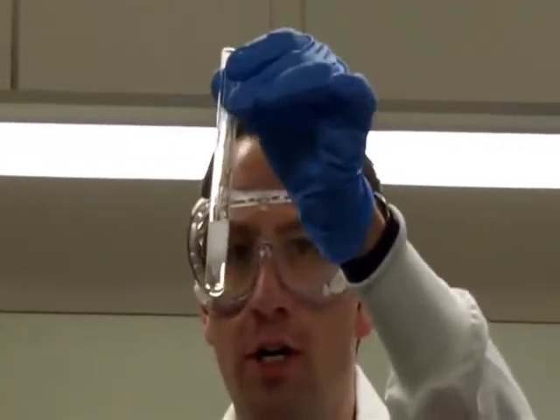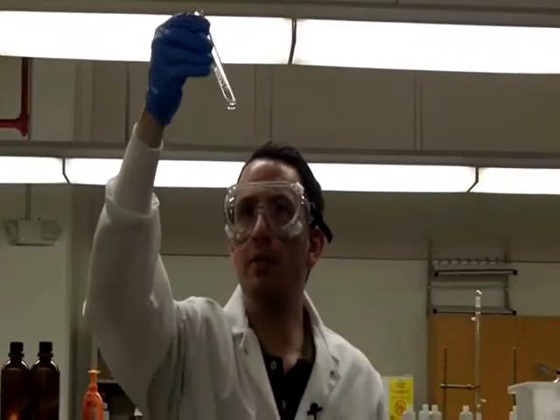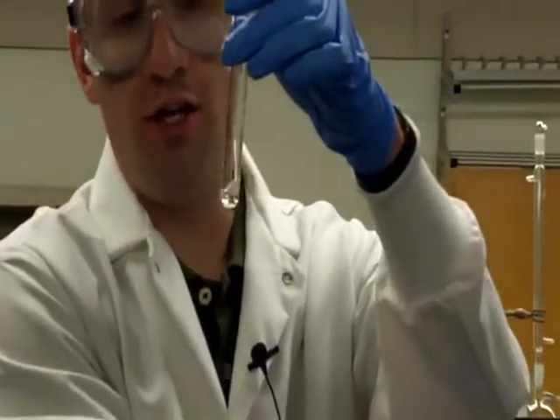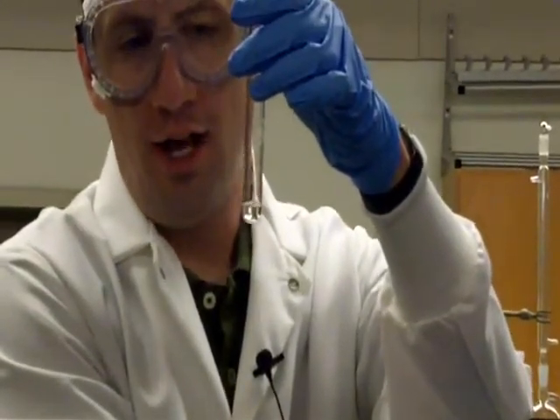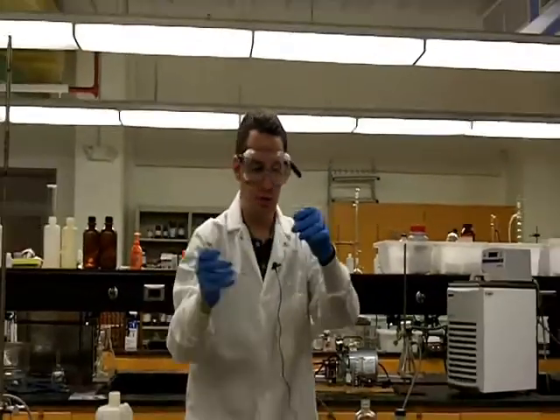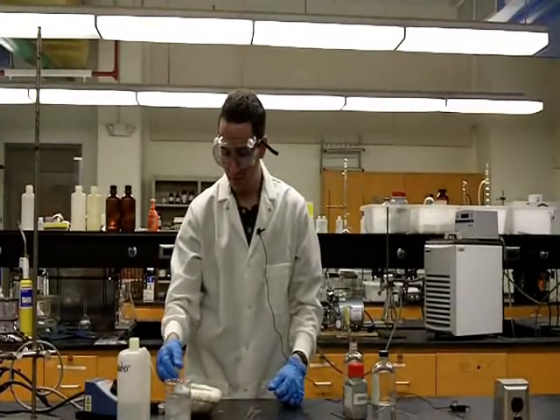Now we can see they've both come to a boil, and we have two very different results. In the case of water, even in boiling water, the fluorene has still not dissolved. So since the fluorene has not dissolved at high temperature, that also means that it's a poor solvent. In the case of methanol, we can see that some of it has dissolved. And so by increasing the temperature, we've increased the solubility in methanol.